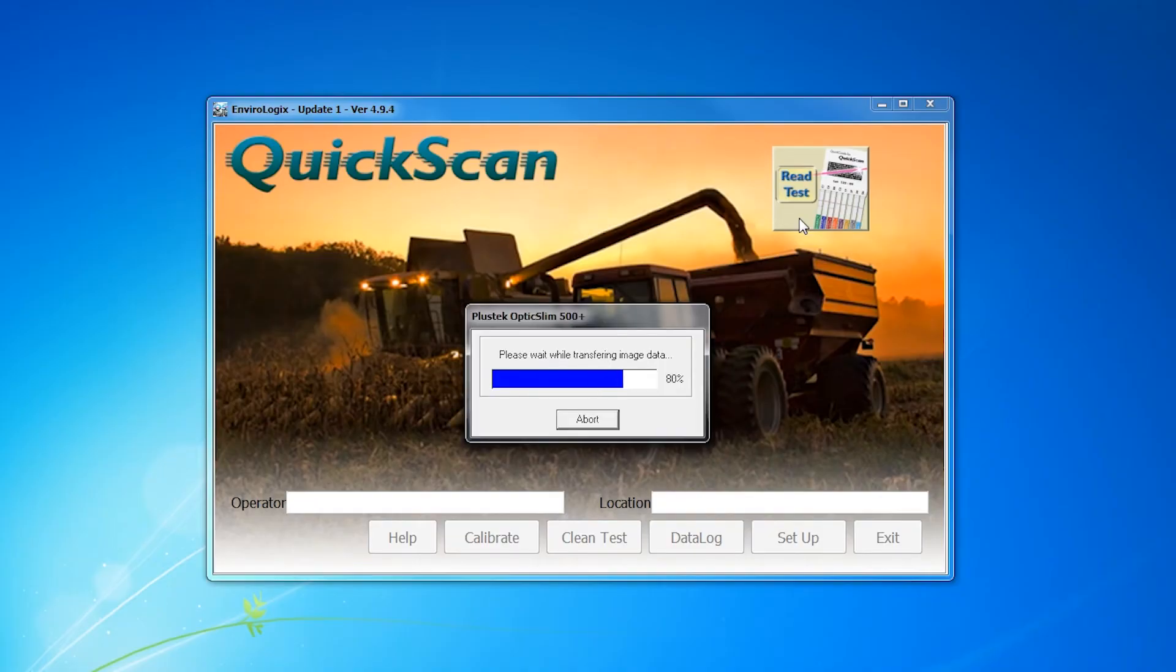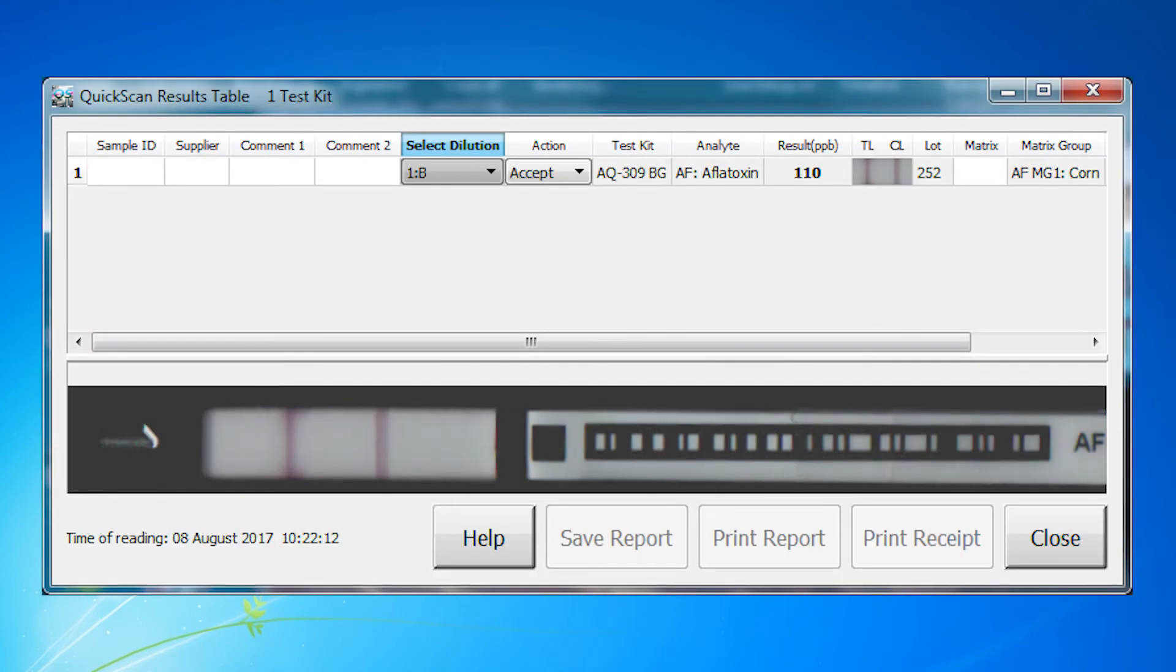Step 6. On the quick scan results screen, choose 1B under the dilution tab drop-down menu. The system will calculate and record the aflatoxin level in the diluted sample.